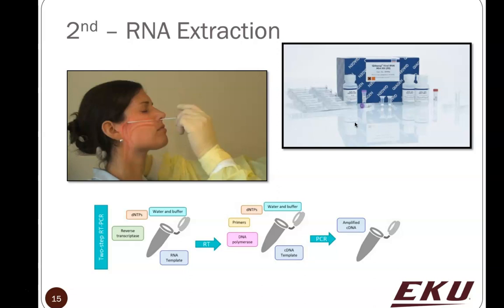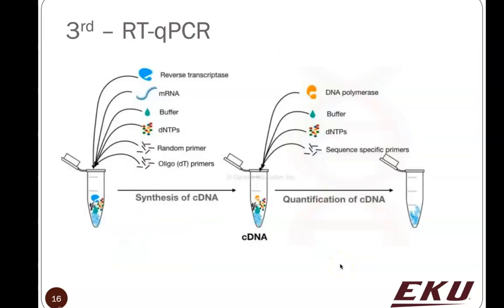So we have to get the RNA off of that and then have it ready in solution for us to be able to start our qPCR process. So when we do qPCR, and this is very much a simplification, and sometimes you have different size tubes depending upon what you're using, you have to have your initial RNA in the solution, whatever you've extracted from a patient, from an individual.